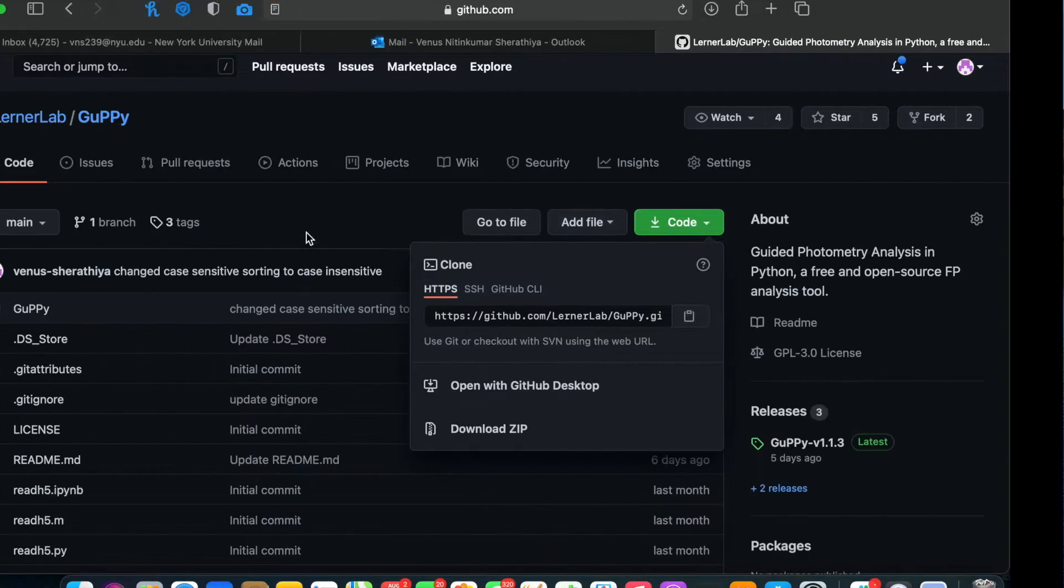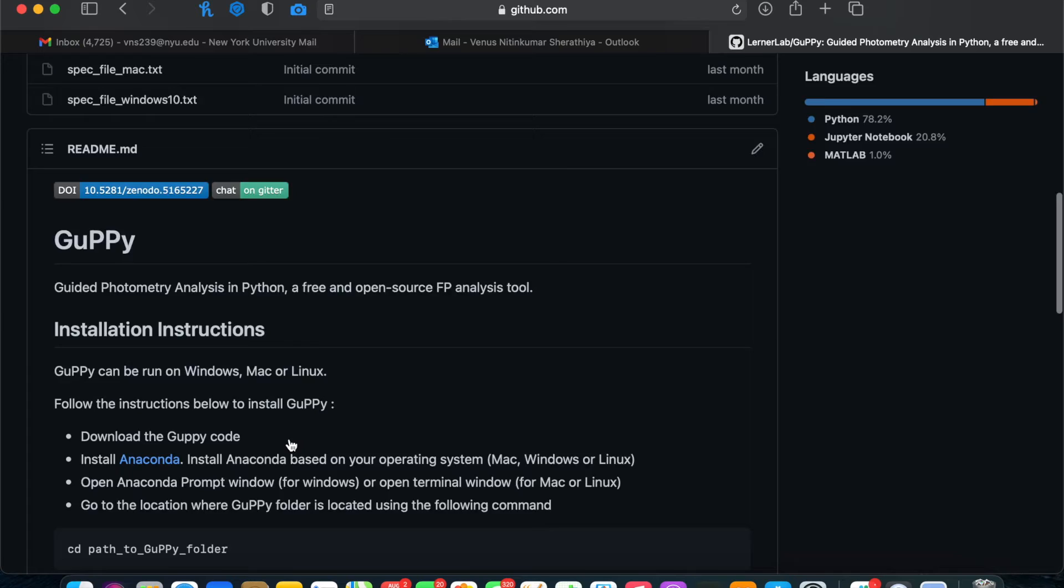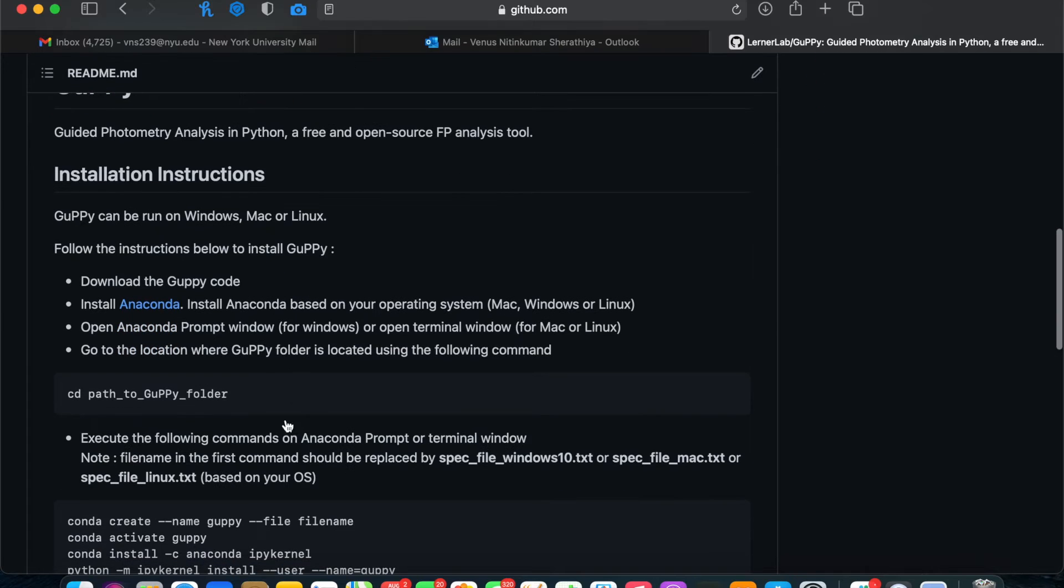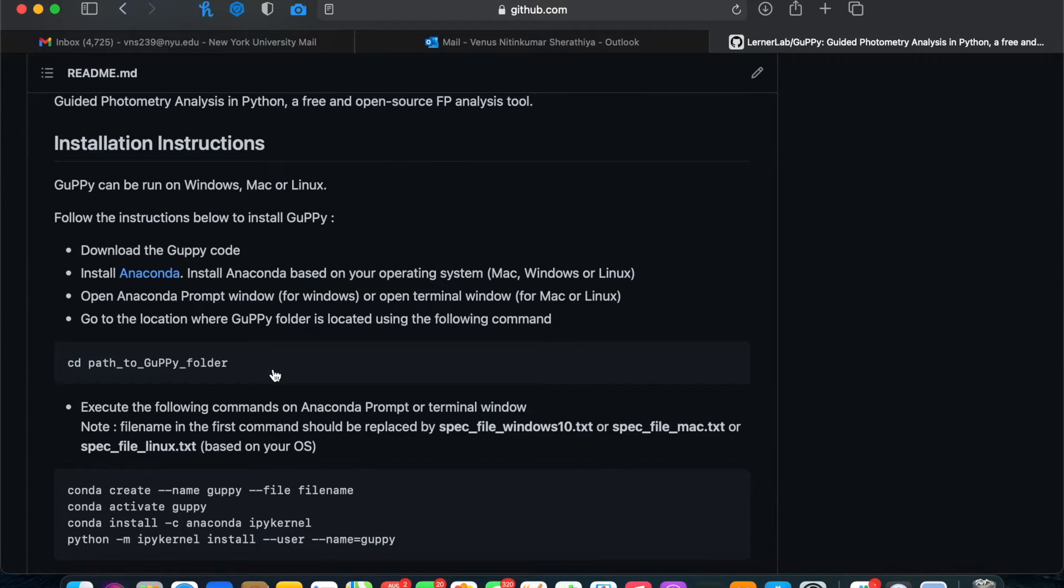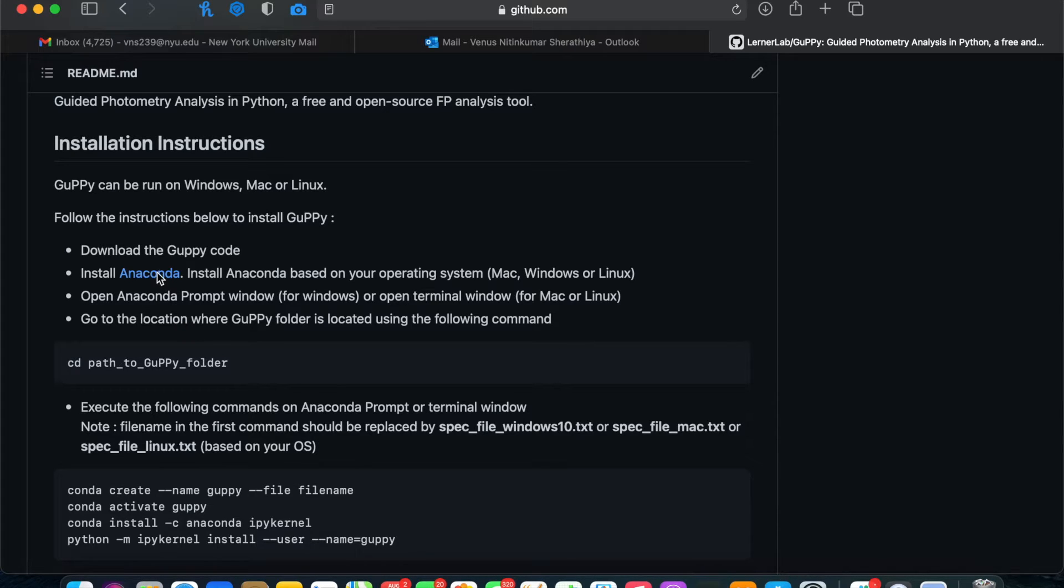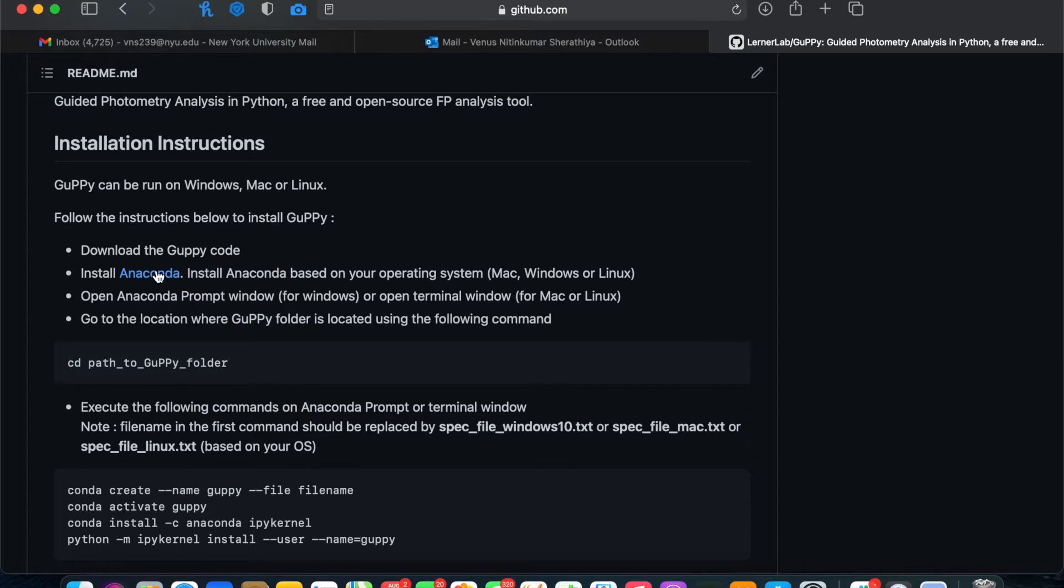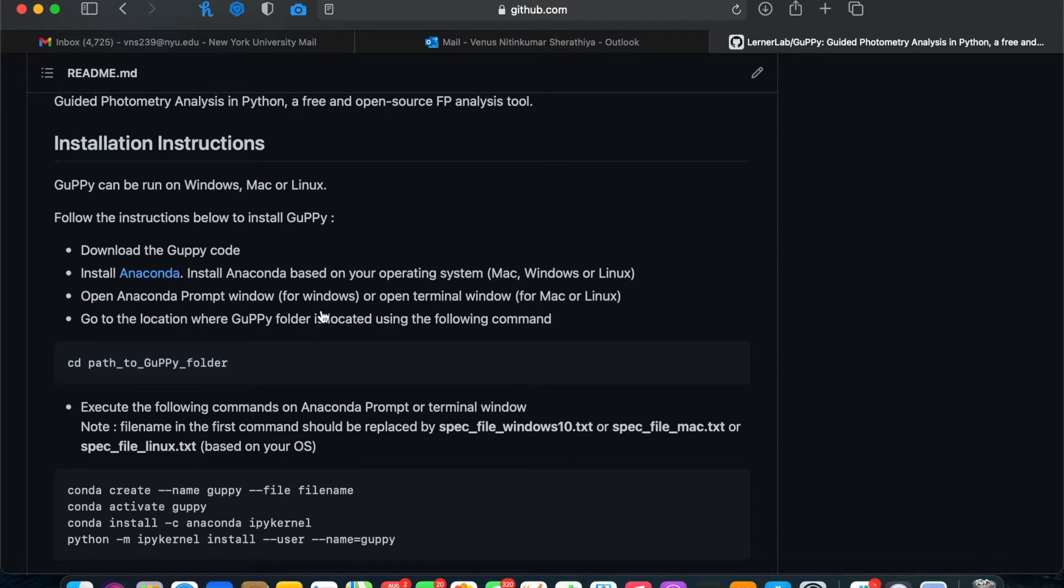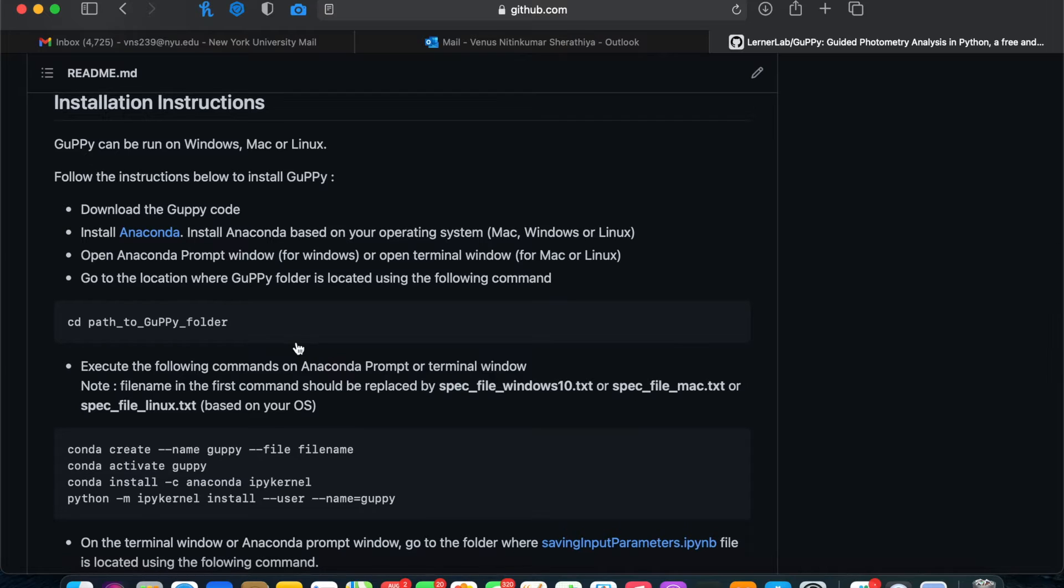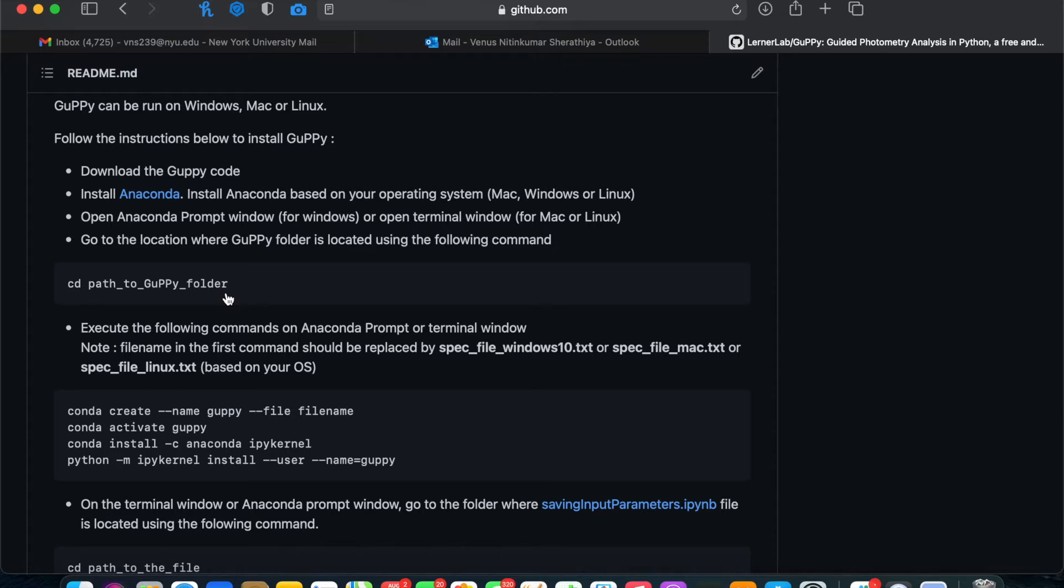Next, following the instructions on the GitHub page, you'll need to set up for the first time if this is your first time using Guppy. To do this, you need to install Anaconda. Once you've followed the instructions to install Anaconda, which we won't show here, click to open either a terminal window if you're using Mac or an Anaconda prompt window if you're using Windows.